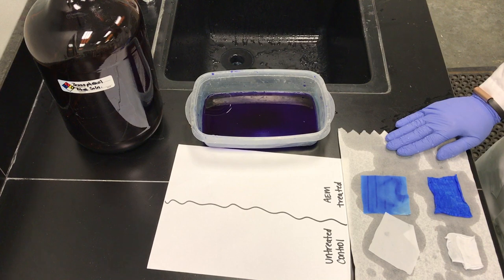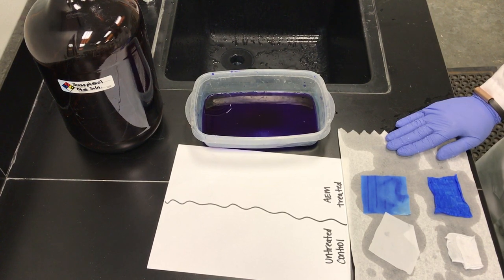The BPB staining can only determine if there is a cationic presence on the surface of the fabric. It does not validate any antimicrobial efficacy.